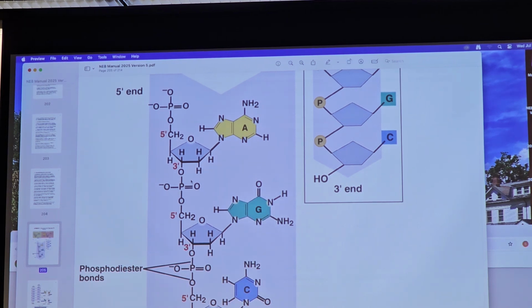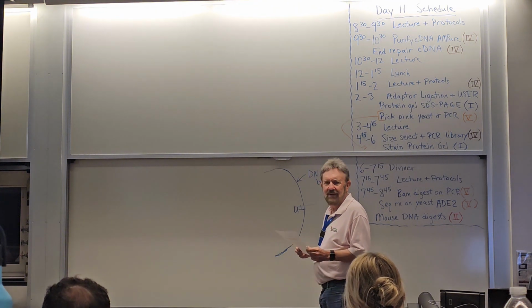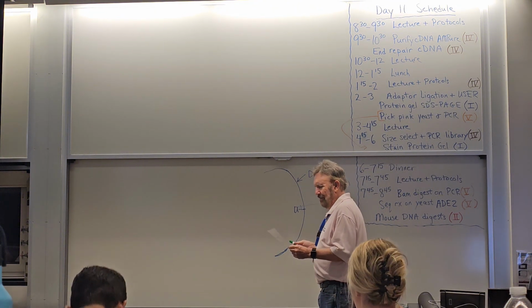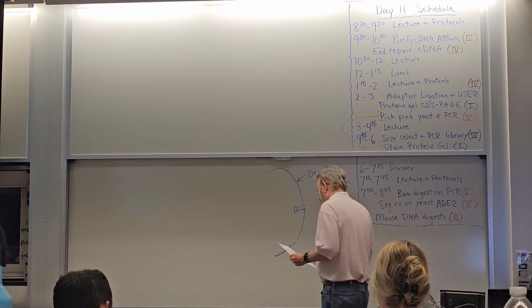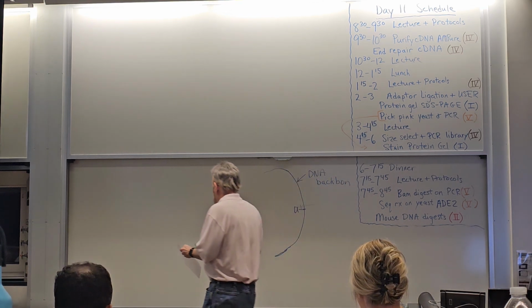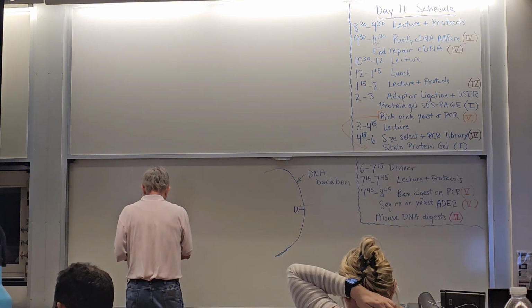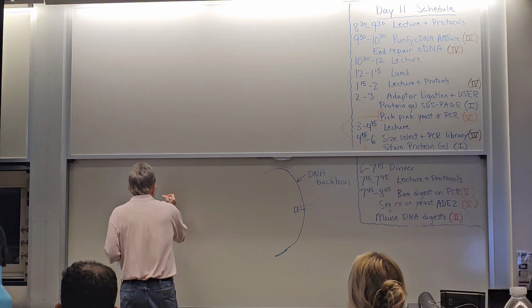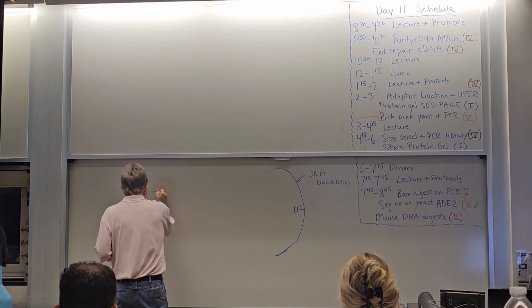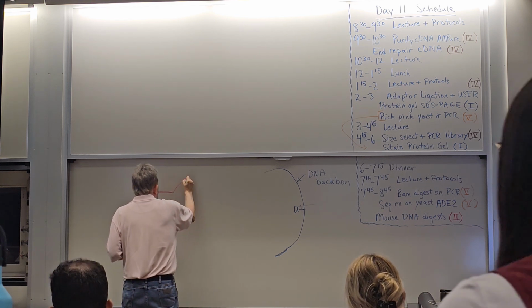Think about the adapter itself. It's yellow and green in your diagram, but I can't use yellow, so I'm going to do green and red instead. Red is going to match the yellow in your diagram. So on our adapter, we have this, and then the blue.